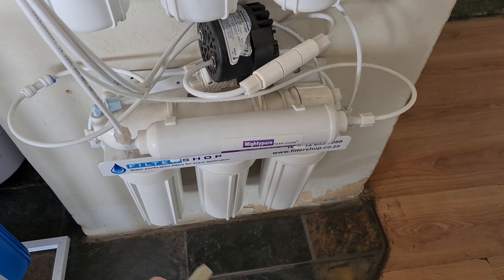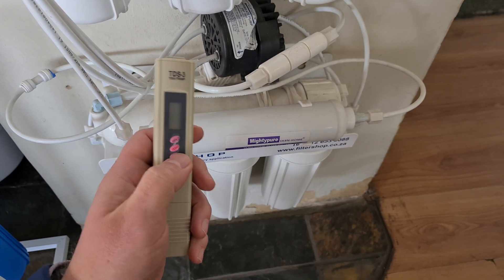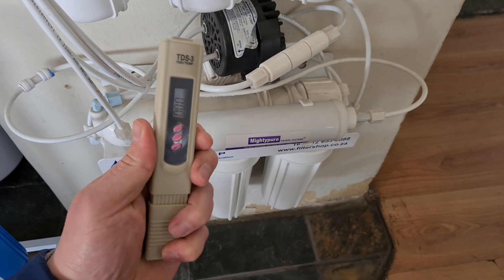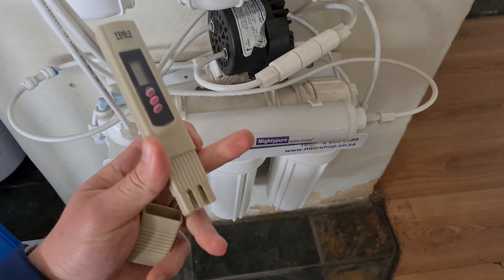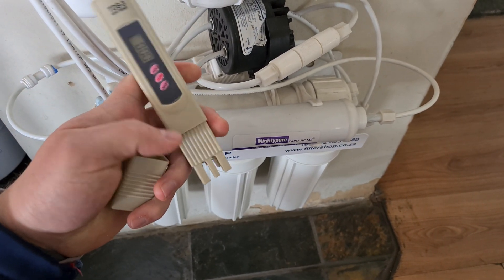To test if the membrane is functioning correctly, you can use a TDS meter. This TDS meter is simply on and off with a cap and just needs to be submerged into water up until this line.